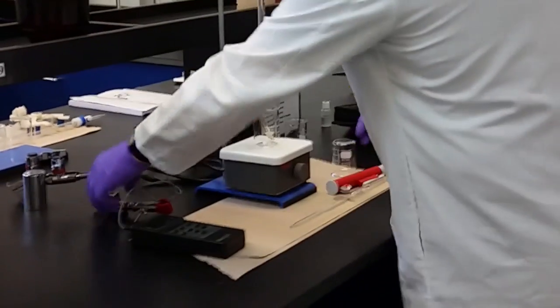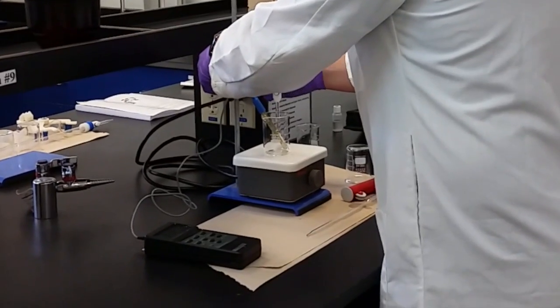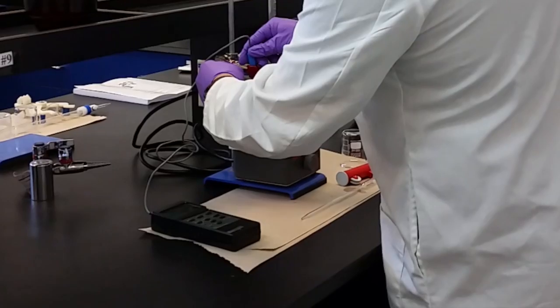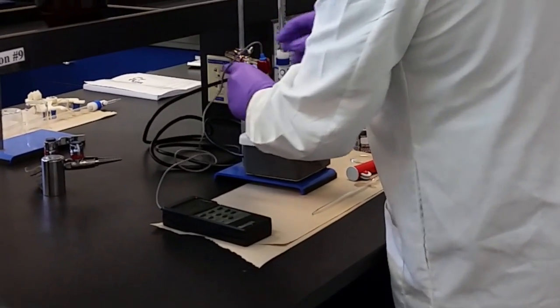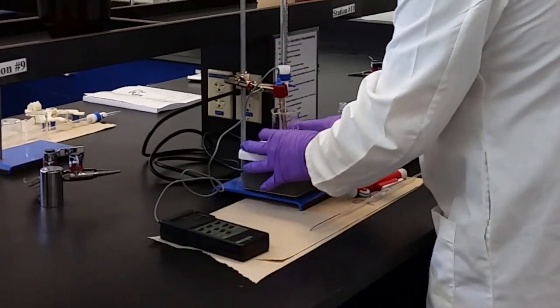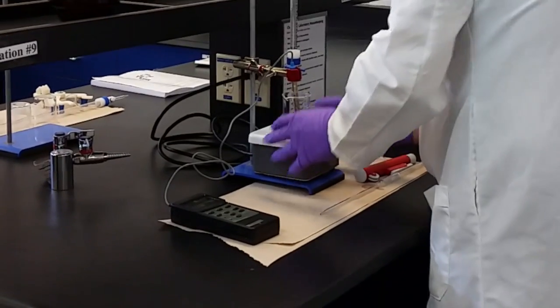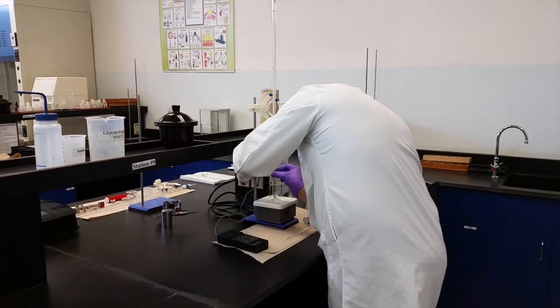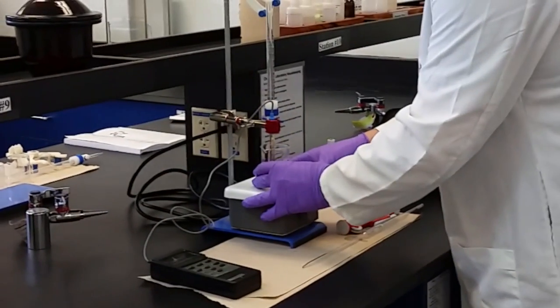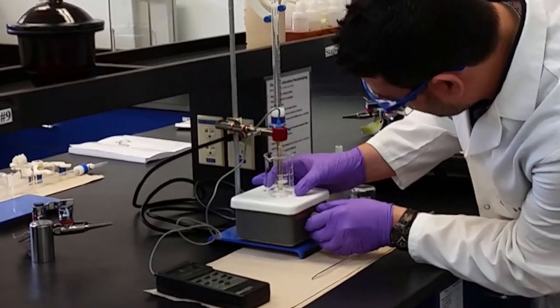Now, you need to make sure that the magnetic bar doesn't touch the probe. And for that, you can use a clamp. So you can put your probe down as much as you can in a way that it doesn't touch your stirrer when you stir. Okay?